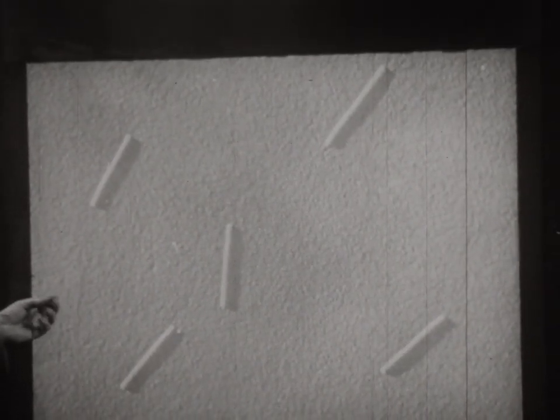An amusing variety is this insect virus, the tipula virus, whose outlines are perfectly hexagonal, corresponding to the polyhedral shape that we saw in the model. And last, we can take a look at the tadpole-shaped viruses, or the bacterial viruses, one of which is frozen dried, and the other two of which are air dried. So we can get a pretty good idea of the shapes and sizes of viruses.